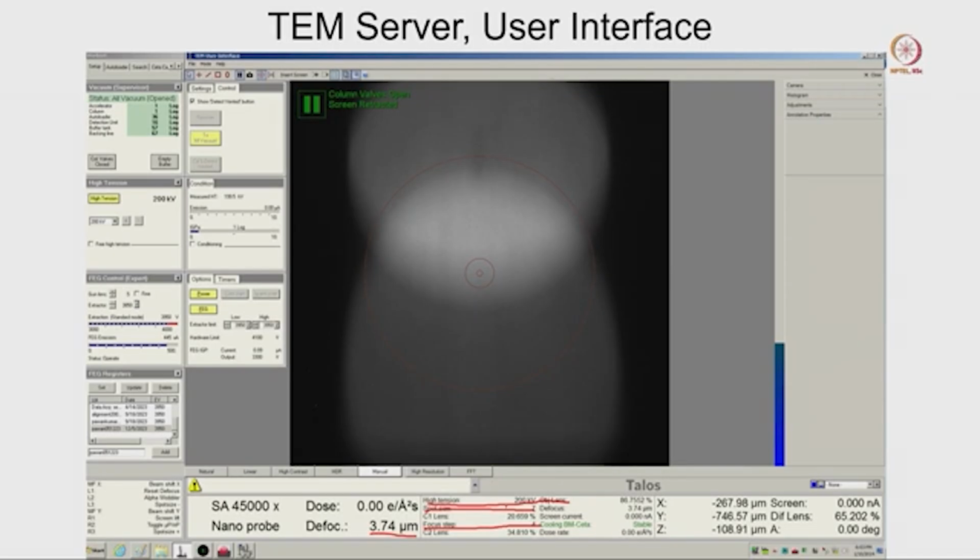So the focus step dictates what kind of focus you want. You should pay attention to fine focusing. Most of the time it is better, when you are focusing, to decrease the step size to 1 or 2. Another important part is the defocus, your dose and your magnification.